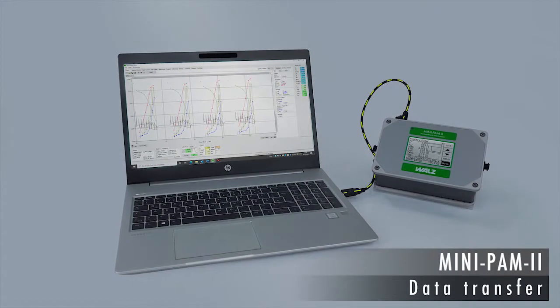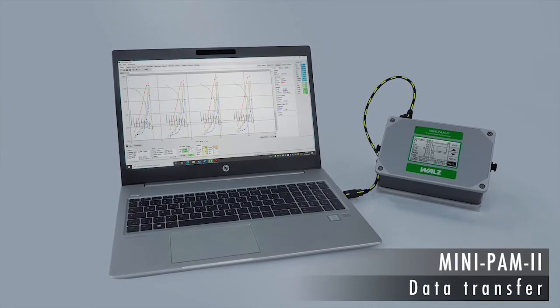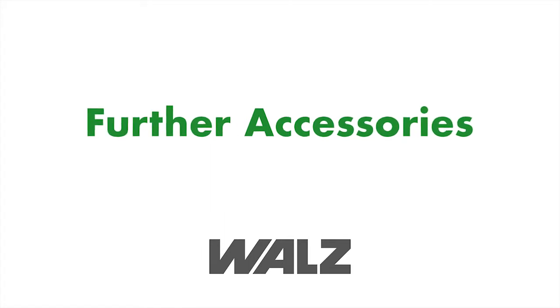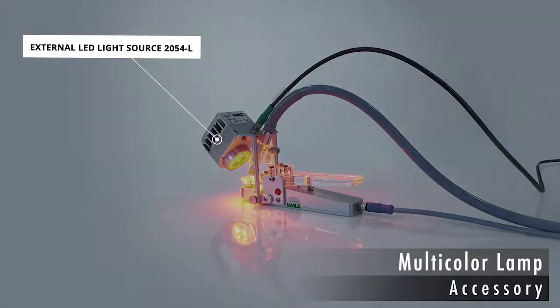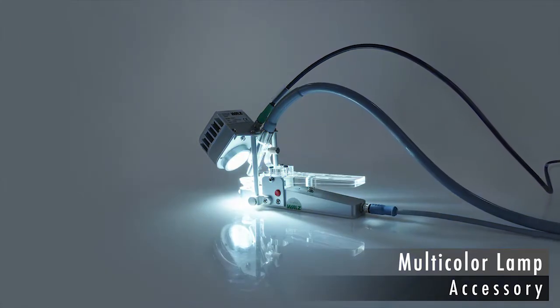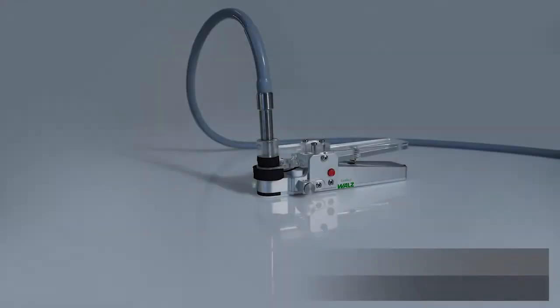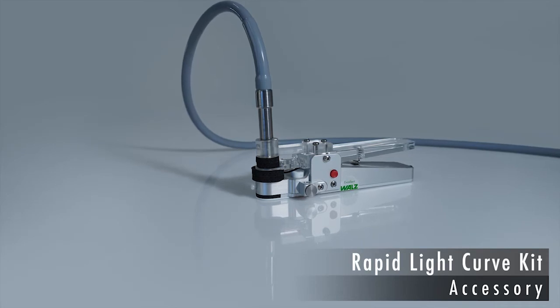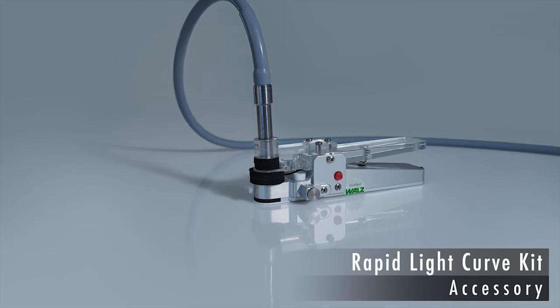Data acquired in the field is easily transferred to a Windows computer running the software WinControl 3. The MINI-PAM2 fluorometer can also be upgraded depending on your experimental needs. A high-intensity lamp emitting red, green, blue, and white light allows for flexible design of spectral properties. To record rapid light curves, a conversion kit for the 2035B field clip is available to screen off external light.